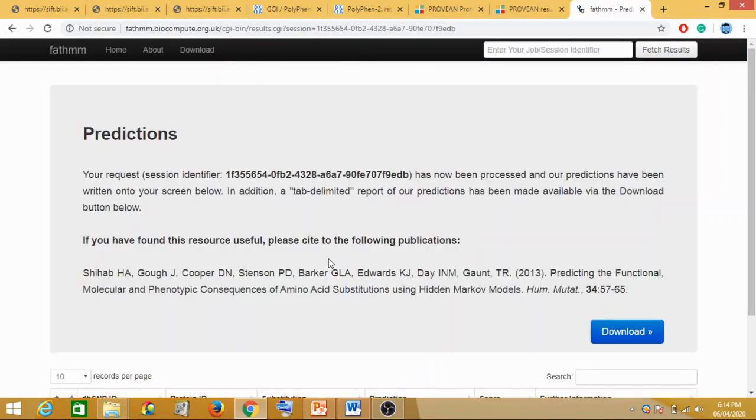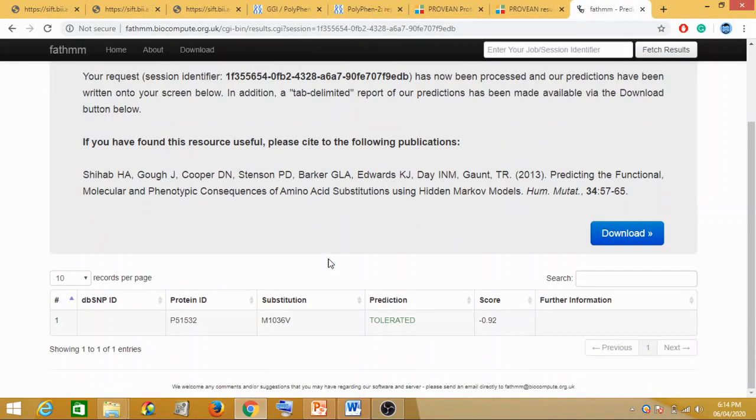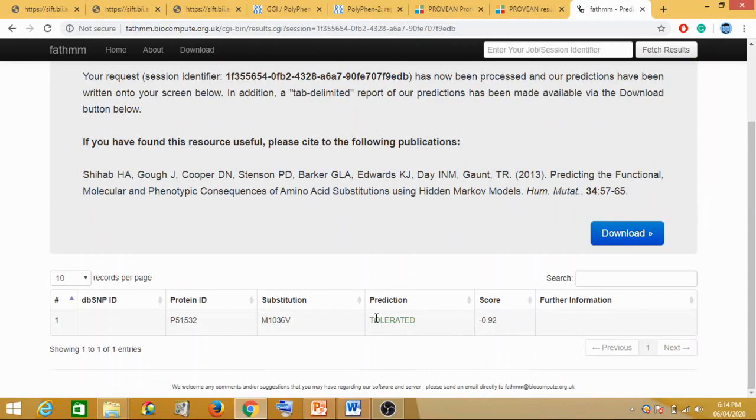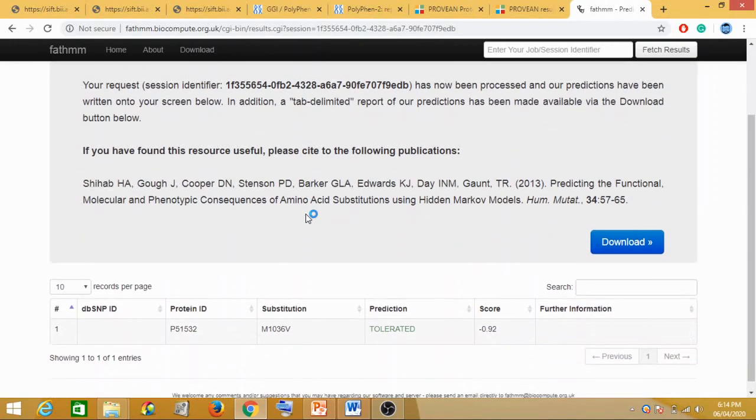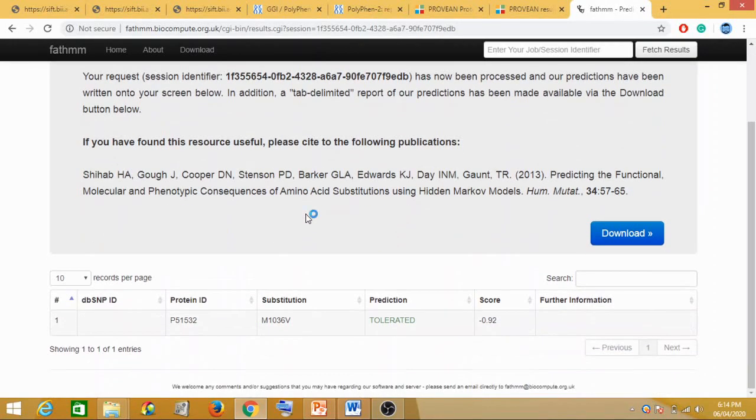Now for FATHMM. The FATHMM score was -0.92, and the prediction here is tolerated. So if we are using HMM approach for carrying out mutation analysis for this, it has given us not deleterious but tolerated.